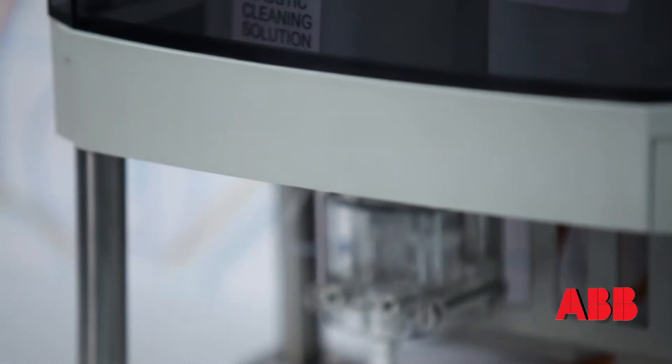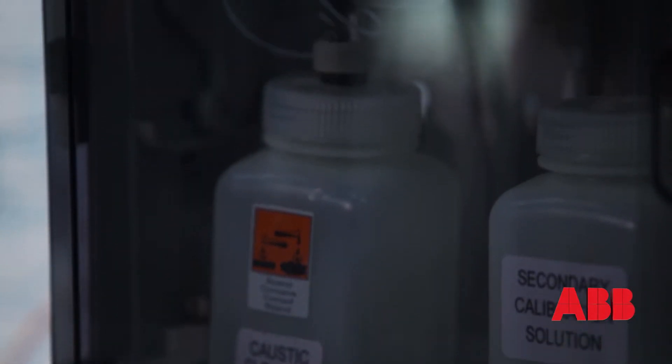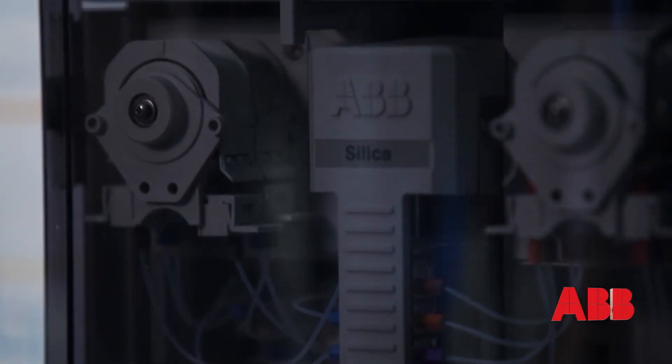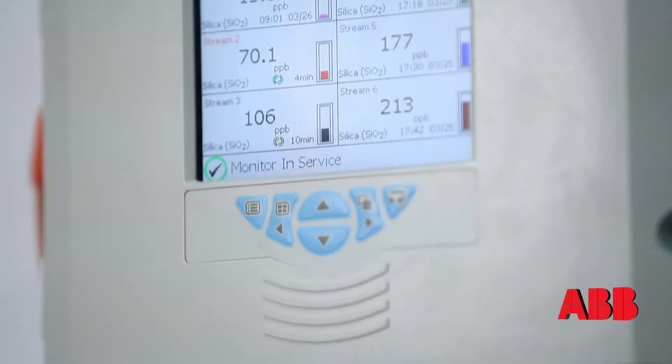The unit itself runs on a continuous sampling system with features of auto-sequencing through a series of constant head units below. What that allows is the customer to configure the unit in terms of sampling each stream individually through a series of sequencing steps.